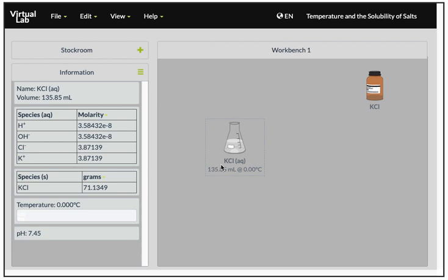So when you add your first data point, which you should do right now, for the temperature of 0 degrees Celsius, you should add the amount of solid potassium chloride remaining in your flask, and then we will calculate how much that means must have dissolved, right? So as you go through, every time you add a value, you're going to add the grams of that species that remain solid in a flask, therefore have not dissolved. And then we will calculate how much have actually dissolved.